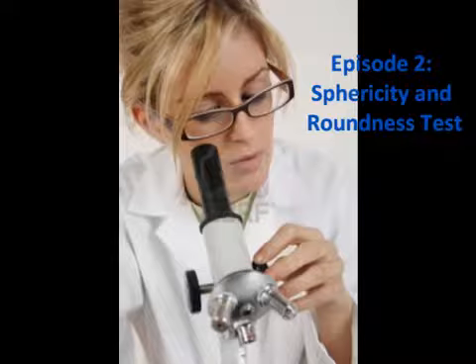Do you have frac sand? Episode number 2, sphericity and roundness testing.